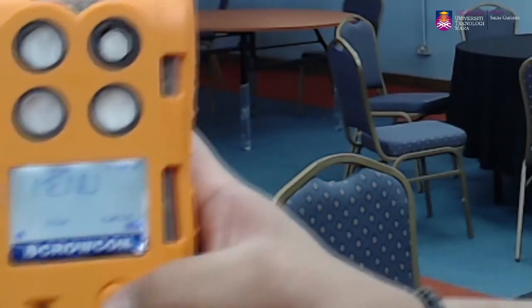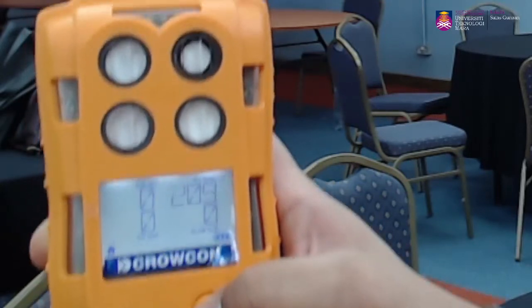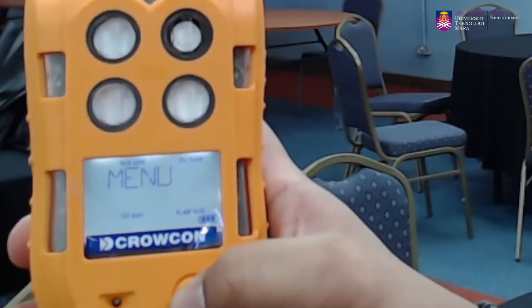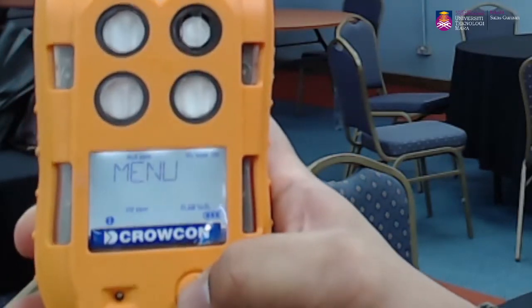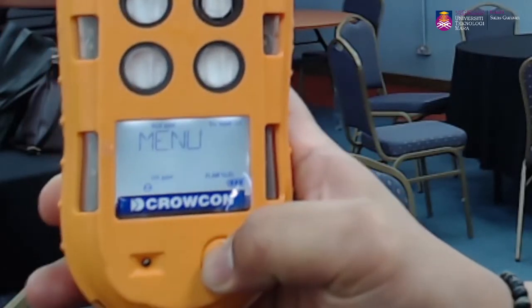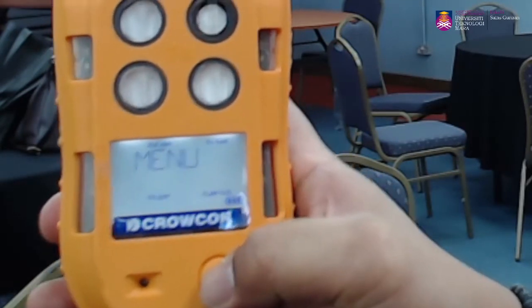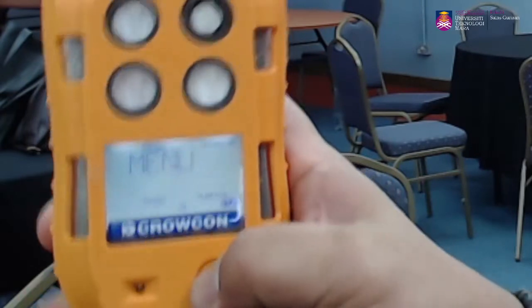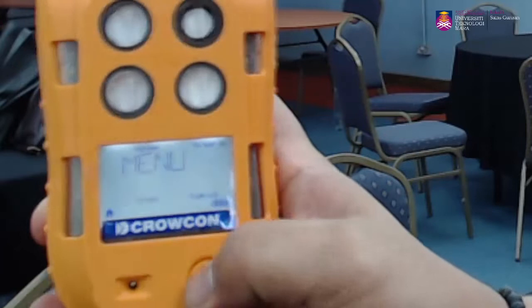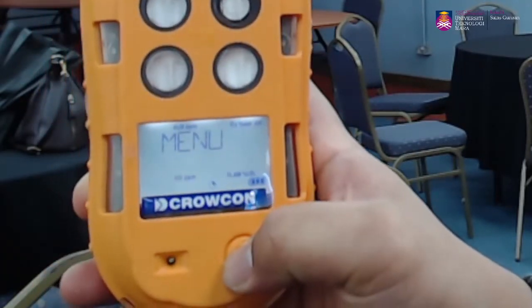So from there, if we want to select, for example, the information section. If we don't select anything, it will go back to the main screen. So to select again, it is double click, menu, then move. If we want STL, we just click until it reaches the STL symbol. Once it appears here, we scroll through until STEL.